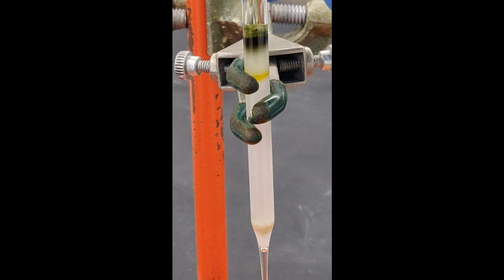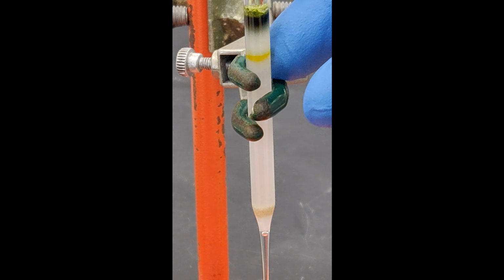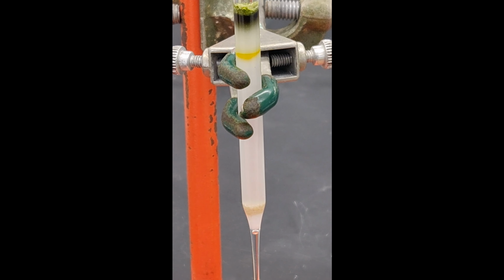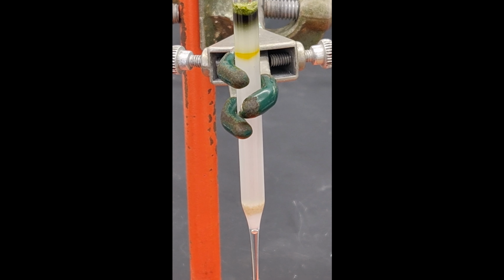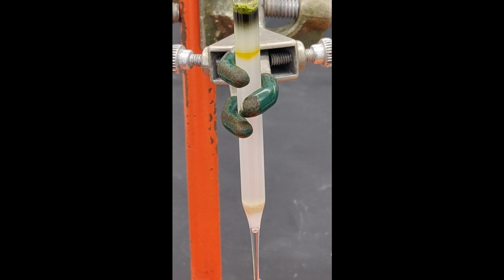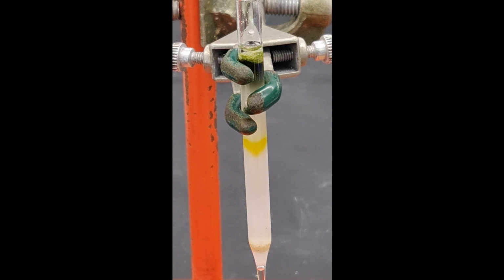As you watch the two major groupings of colored bands of pigment elute from the column, attempt to collect all yellow bands of color into one small test tube and all green bands of color into another small test tube, while collecting the dead volumes, that is the clear liquid where no colored compounds are eluting, into the 25 ml Erlenmeyer flask. Try not to collect any of the dead volumes into the tubes containing the colored pigments, because that will dilute the colored fractions, making them less intense in color.